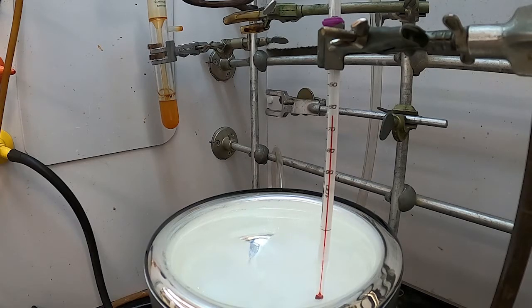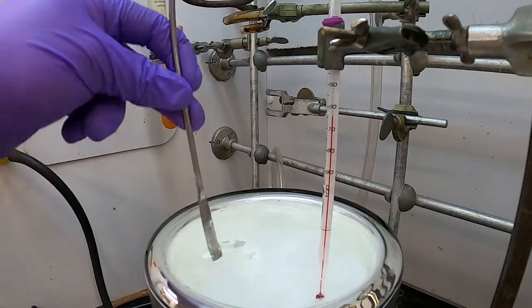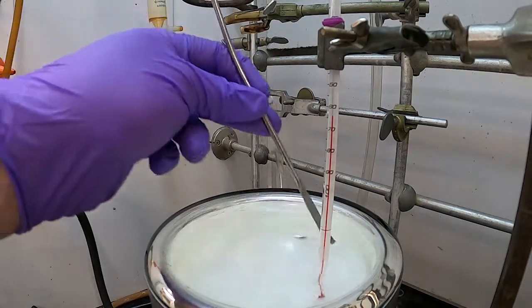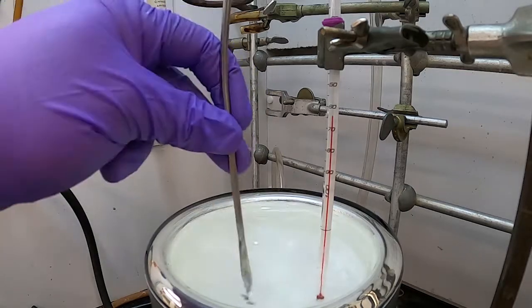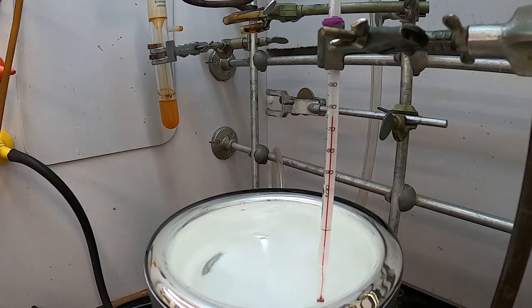So to maintain your temperature, you'll probably have to add dry ice every probably 15 minutes. Once you've gotten it to temperature, maybe not a lot every 15 minutes, a small piece to maintain your temperature. But the biggest use is going to be at the beginning, just getting it cold, getting it down to a useful temperature.